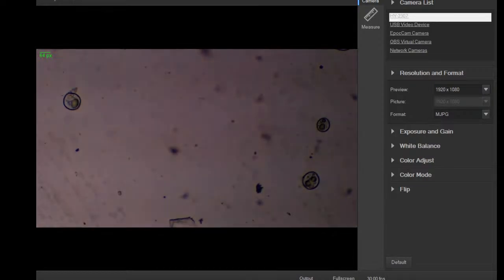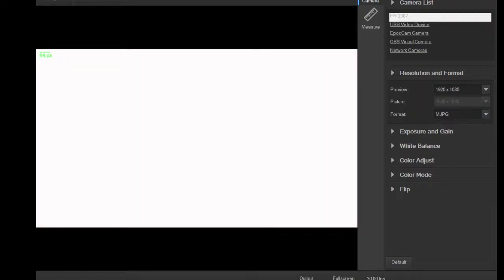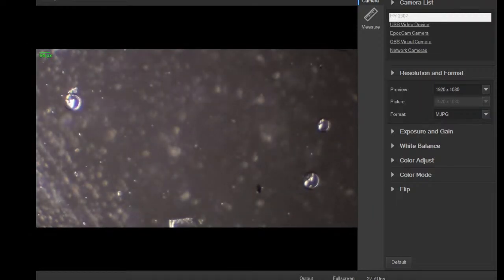Let me get a better view here. It's very dim. There you go, a little bit of dark field. That's always fun.